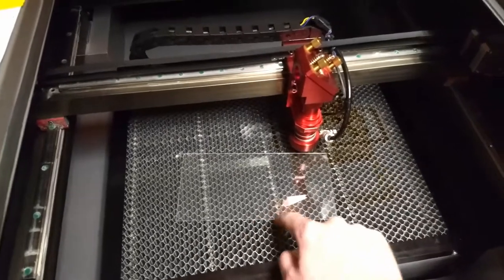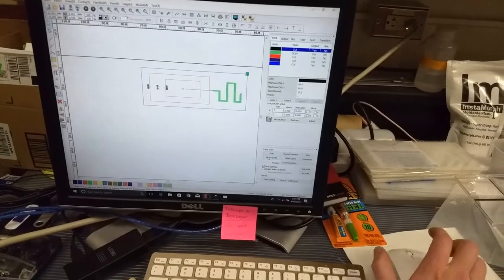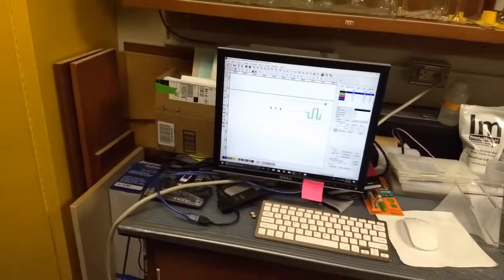Once you get the acrylic positioned under the laser head, you want to make sure it's focused — that's done by a control on the panel. You load up your design, hit go, make sure the cover is closed or the laser won't fire, and you can see the laser head translate as it goes through the motions of cutting the design.